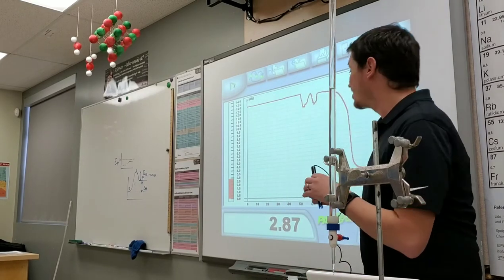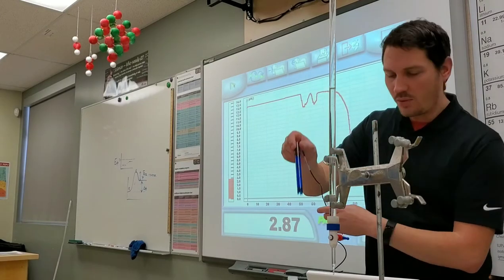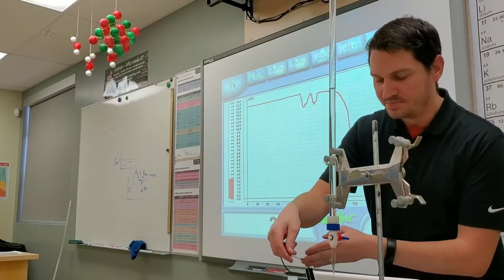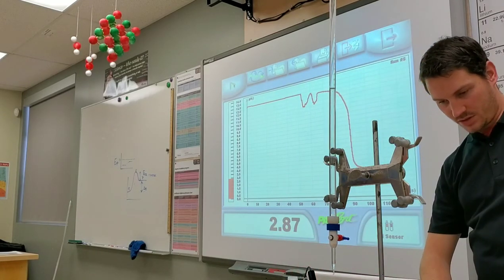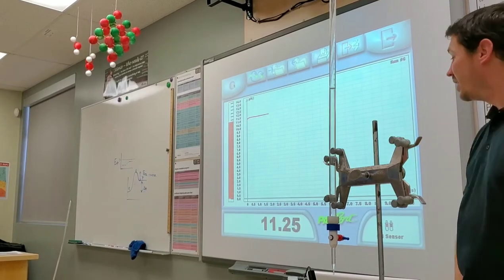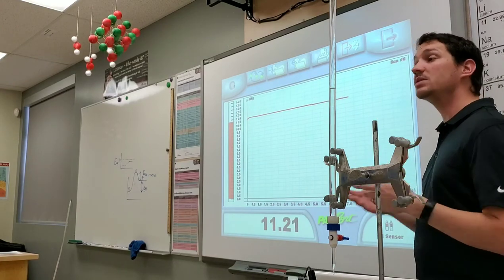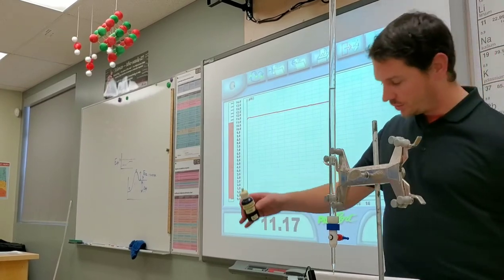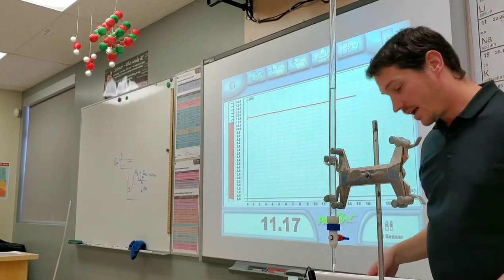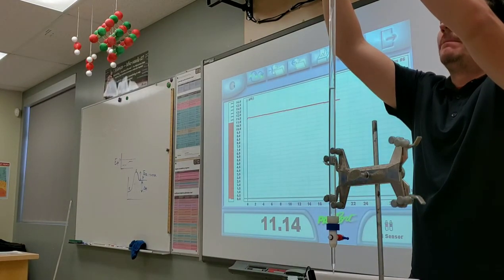What was the pH that I started at with the strong base this time? It's 12.86, something like that, right? And so let's see. I'm going to start measuring the pH. And we're starting out at a little bit lower of a pH, and that's fine. That's not always the case for a weak base. It depends on the concentration, but that's fine. So I'm going to add my bromothymol blue, and it's blue for sure. Now I have to add more hydrochloric acid just to top it up. Perfect.